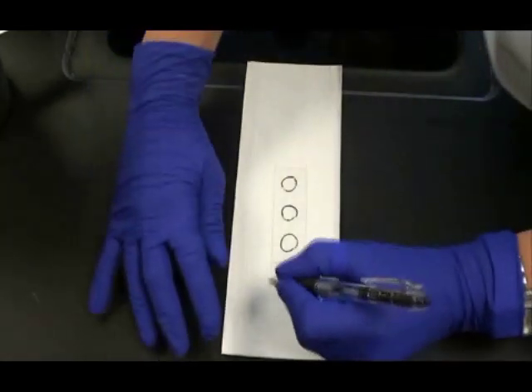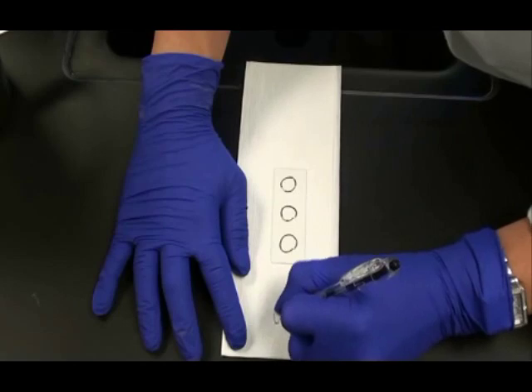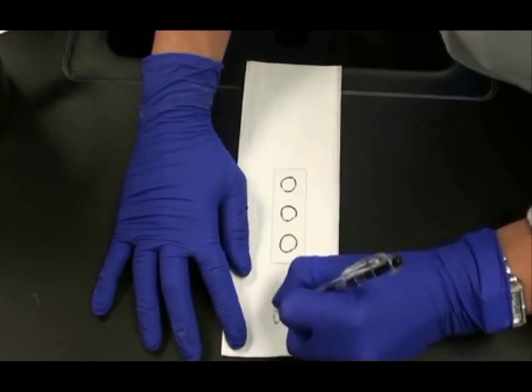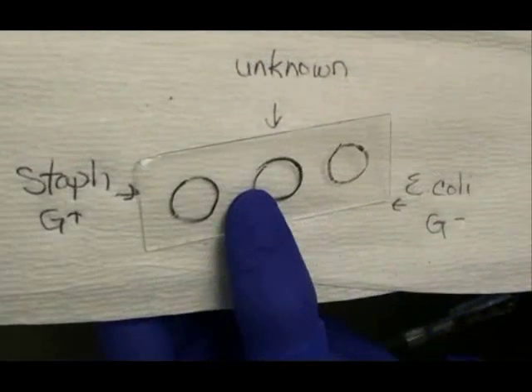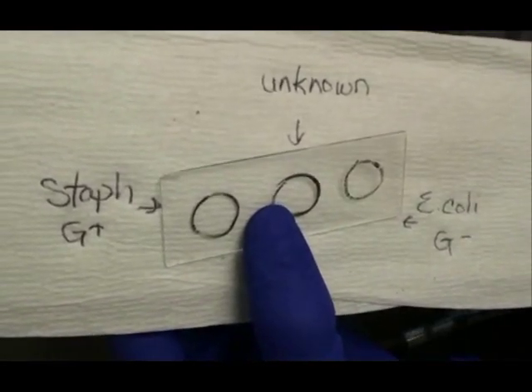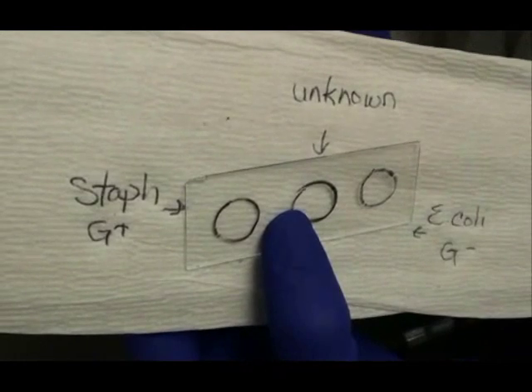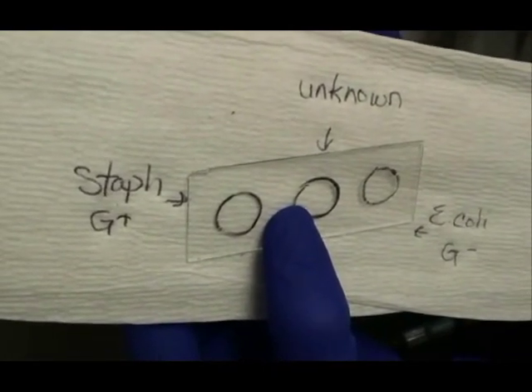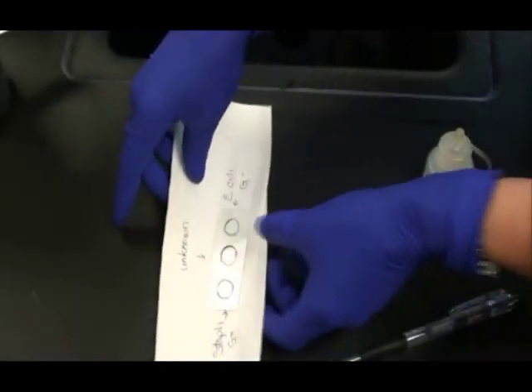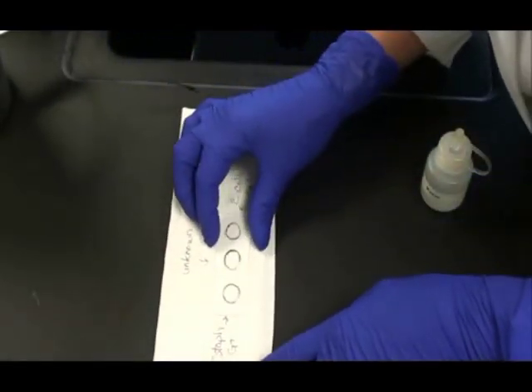It can be helpful to put your slide on a paper towel and label that paper towel with the names of the bacterial samples that you're going to put on it. It helps you keep track of what you're doing. So we're going to have our Gram positive control Staph on the left, our Gram negative E. coli control on the right, and our unknown is in the center.